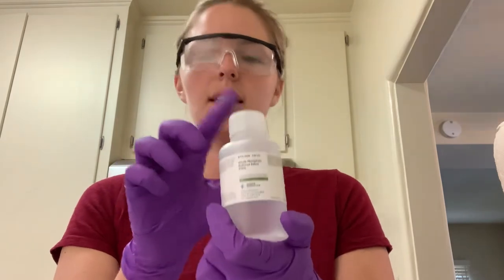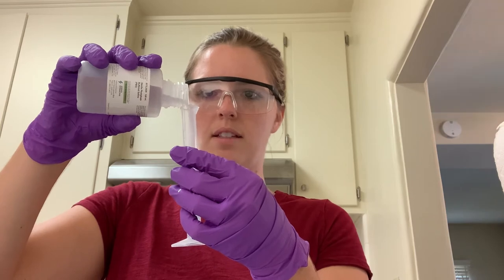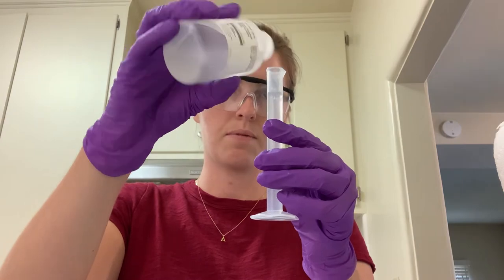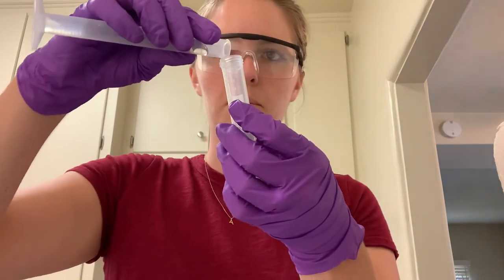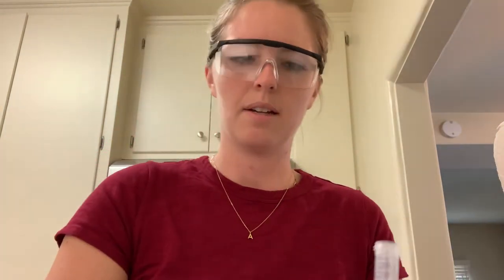For the stock soil tube, the first thing you measure is 10 milliliters of PBS liquid in your graduated cylinder. Pour it in slowly because it quickly hits the 10 milliliter mark — you don't want to go over. Now I'll pour that into my stock soil tube. You can see it's right at the ten milliliter line. Seal that and put it to the side for now.